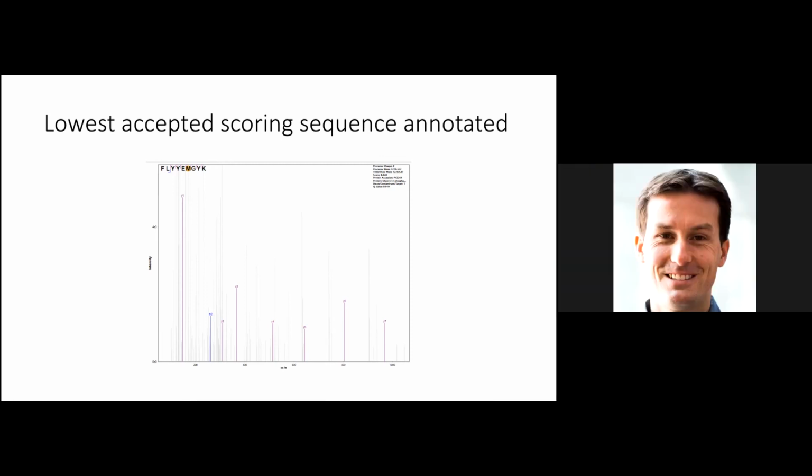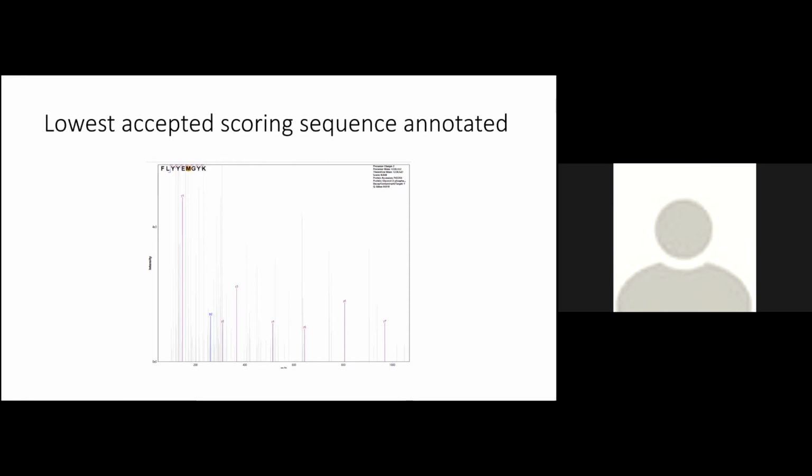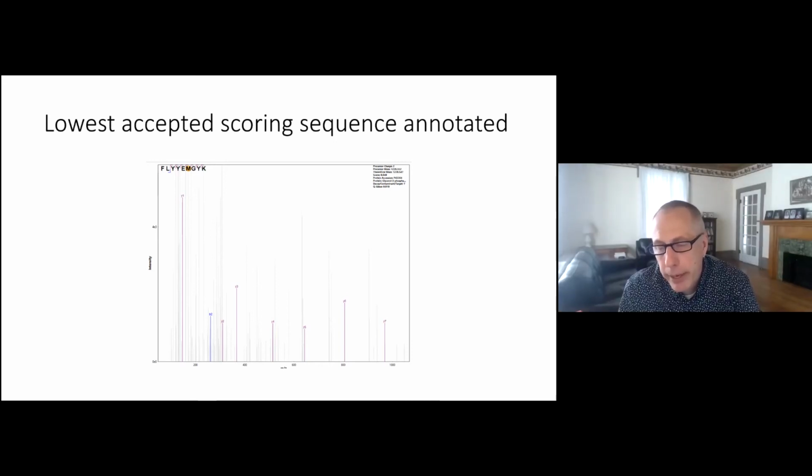Great, thanks. So to clarify this, when you say it's different masses, it's a case where maybe one peptide is 500 Daltons and a +1 charge, and then maybe another peptide is 1,000 Daltons with +2 charge. That would be one example. It can also be the fact that they can be just a little bit different. It could be 500 +1 and 500.1 +1. You know what I mean? There can be very, very small mass differences, and that's not uncommon at all, just so long as they're within that isolation window. You can get a lot of peptides within a few Daltons.